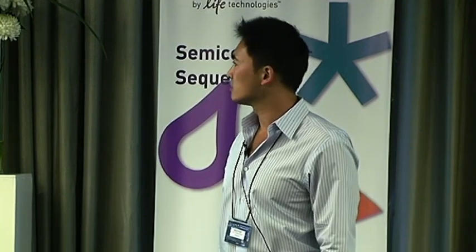And then also I'd like to jump in a little bit after that into a discussion of digital PCR. Digital PCR is something that's gaining a lot of interest around the world right now because it's very different from qPCR. And a lot of times where qPCR stops or reaches a limit in what it can do, digital PCR is another technique that can be employed to get a more refined answer. And so I'd like to talk about digital PCR as well, because this platform is not only a qPCR system, but also a digital PCR system.